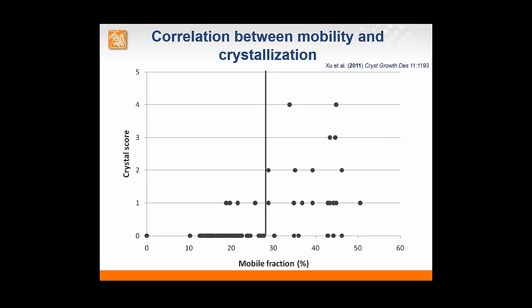When we look back at the images recorded at the time of the FRAP experiments, 12 hours past setup, we observed that in these cases the crystals had already formed by the time we performed the high-throughput FRAP experiment. Therefore, protein had actually already either crystallized or aggregated by this time and didn't diffuse anymore. Crystals didn't grow past this point. So overall, there was a very good correlation between diffusion and crystallization in this experiment.